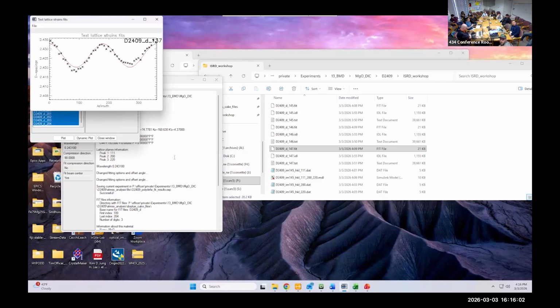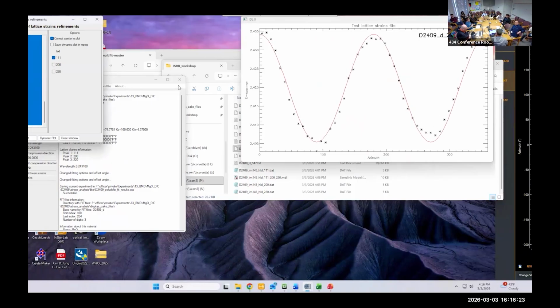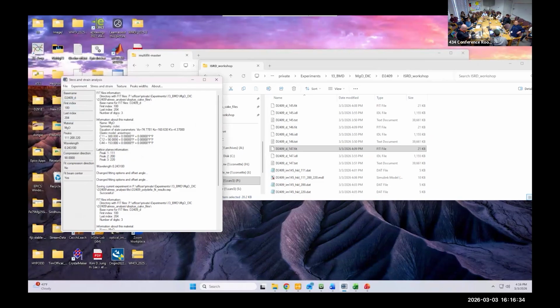It's still kind of off-center. Yeah, it does look like even with the correction, it's still a little off. Oh, it came back bigger. I'd like to sit through it again and see how it does. Oh well, that's a homework assignment.